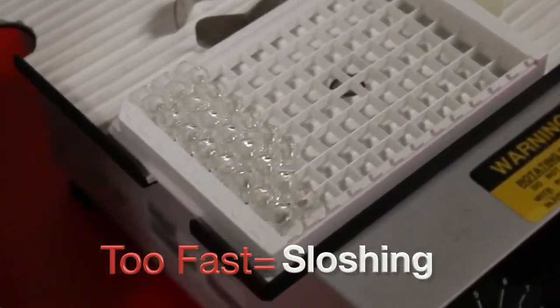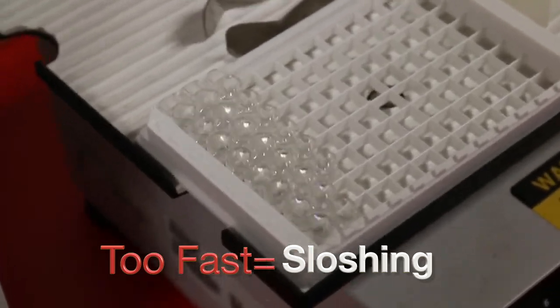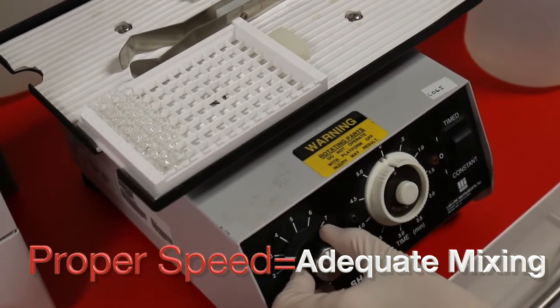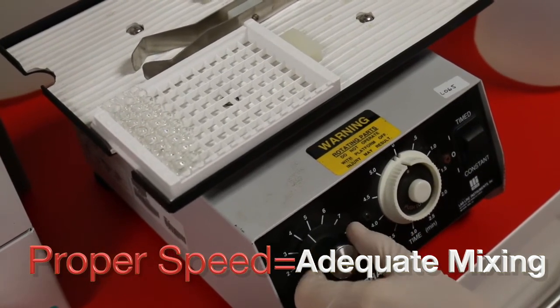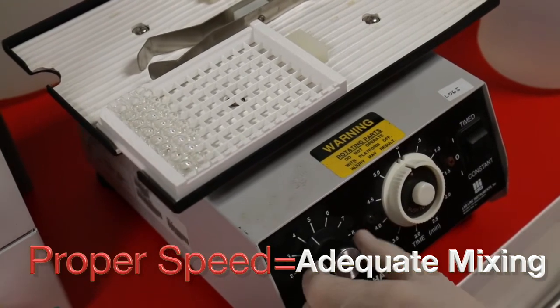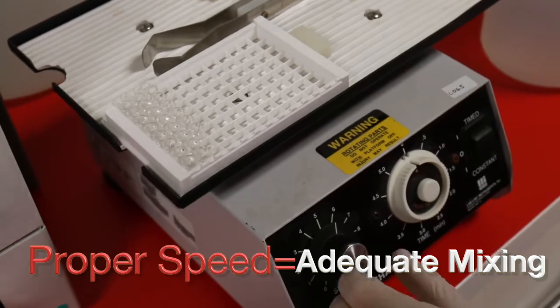But not so much that you risk the liquid sloshing out of the wells. What this setting is will vary depending on your specific type of plate shaker. The exact speed is not important. What matters is adequate mixing of the contents of the wells.